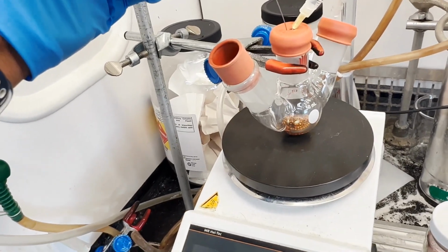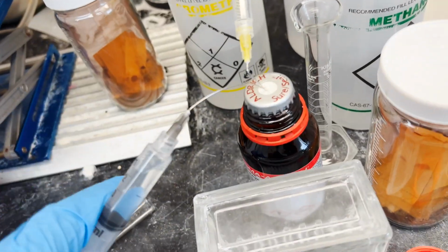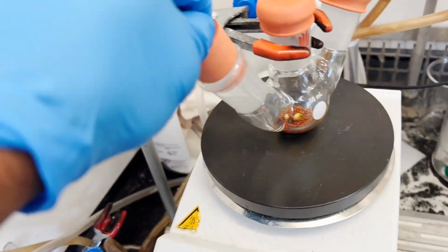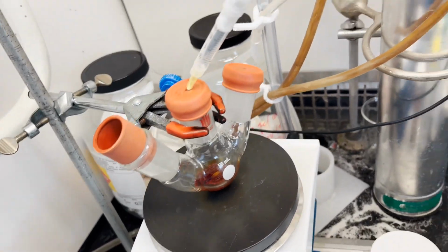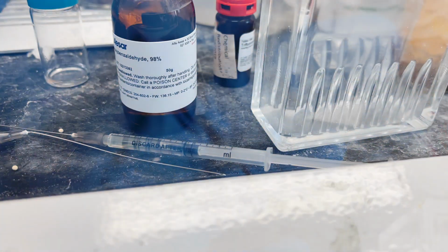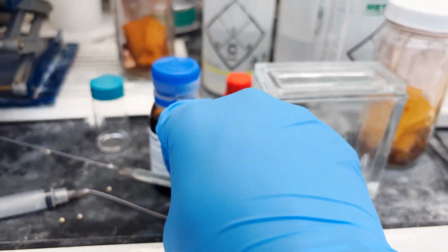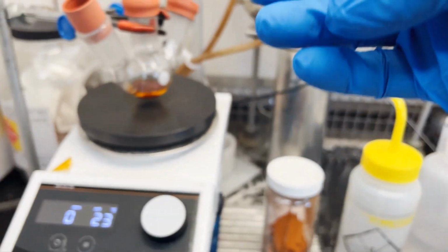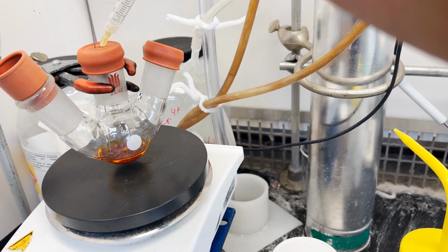But if you search the literature, you might see other options, some other drying agents for these kinds of reactions. So here I'm using DCM to dissolve my amine, and once the solvent addition is done, I'm going to add my aldehyde through the rubber septum. Normally aldehydes are liquid, but sometimes your aldehyde may be solid, so you can measure out your aldehyde in a vial and dissolve it in the same solvent, like dichloromethane. Then take it up in a syringe, and you can add it slowly, dropwise, to the reaction system.